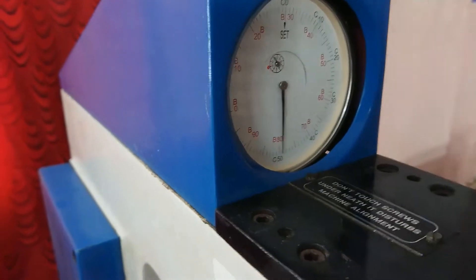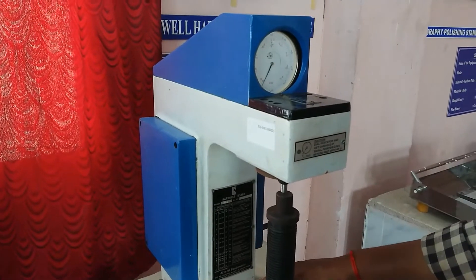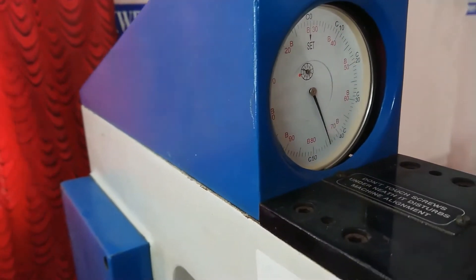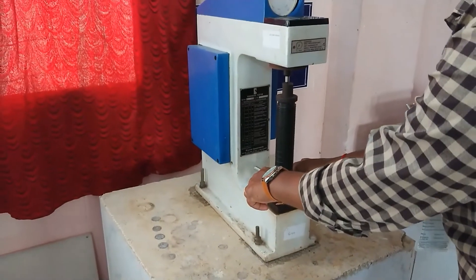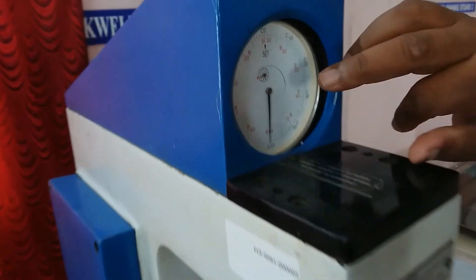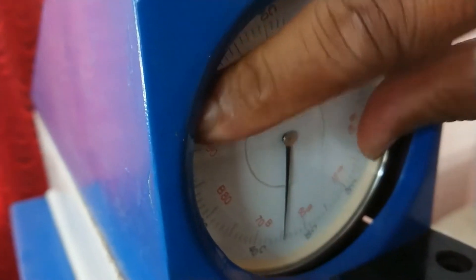You have to apply the preload up to the red mark at point 3. Now applying the load slowly. Apply the load up to point 3, which is the red mark. Now the preload is set — it should be at the red mark 3. Now we have to adjust the dial to the zero setting.